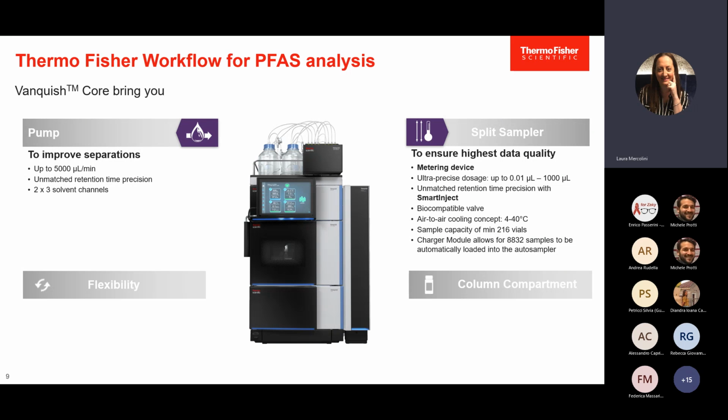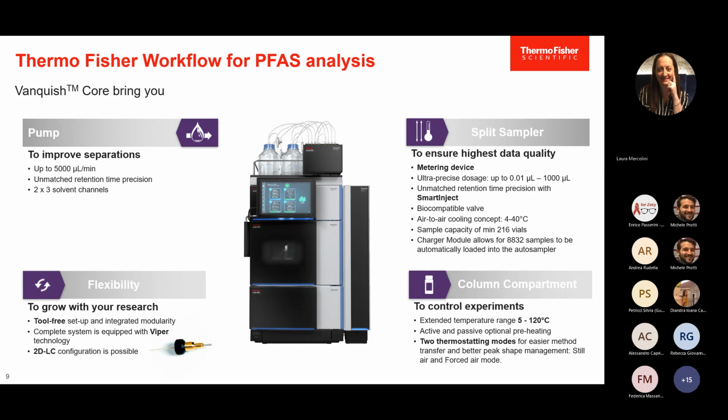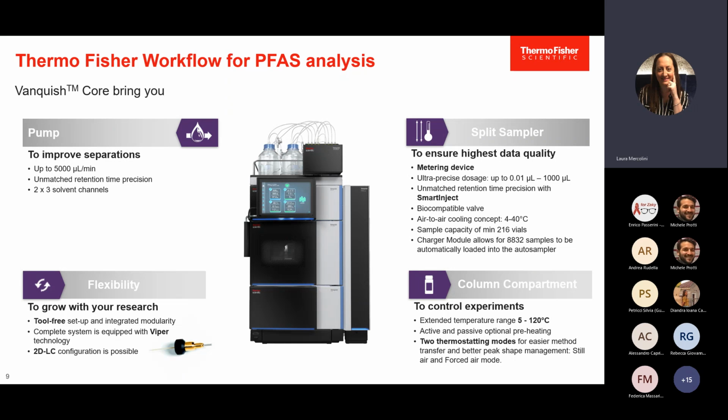So we know that PFAS is a broad range of components, starting from the short chain C4, maybe C2 sometimes, going to C13 or 14 or 18 in food matrices. It is causing challenges for your HPLC if you are not ready. Our colleague has perfectly described the challenges coming from the solvent.